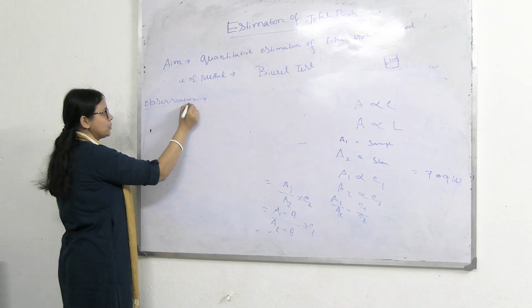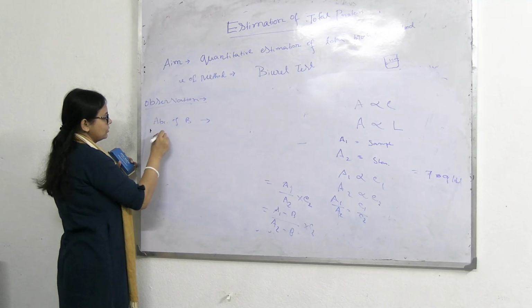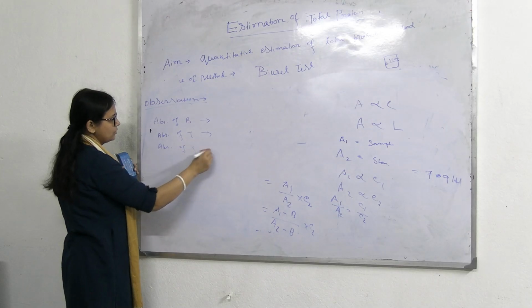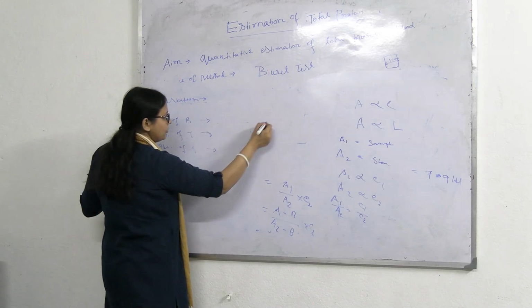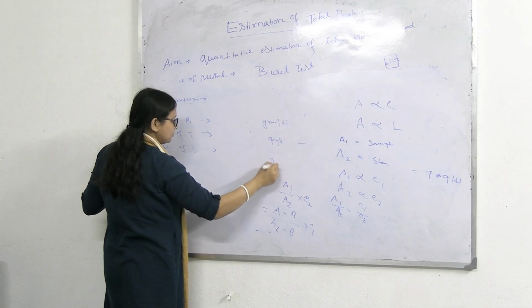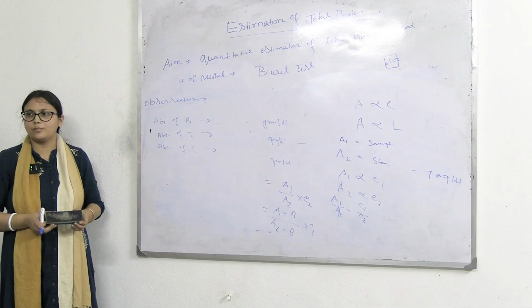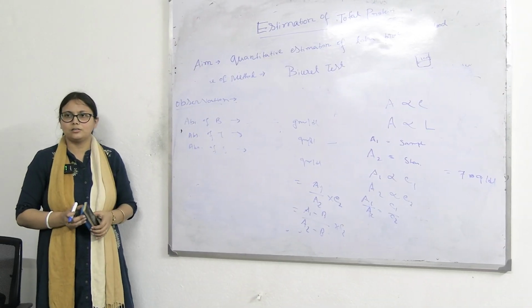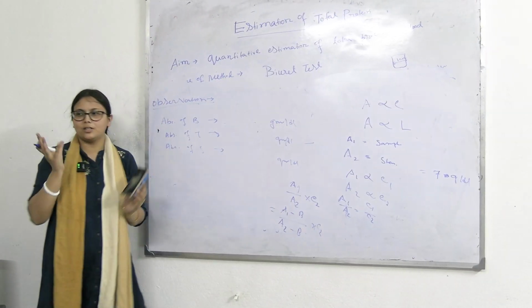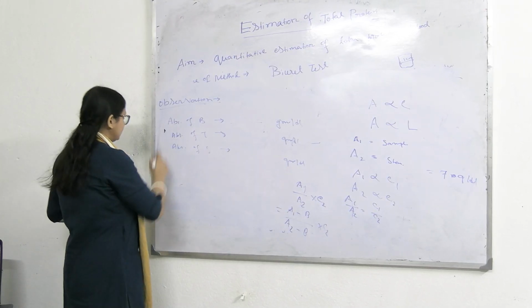অবজারভেশন, নেক্সট পয়েন্ট ইজ অবজারভেশন। অবজারভেশনে কি লিখবি? অ্যাবজর্বেন্স অফ ব্ল্যাঙ্ক, অ্যাবজর্বেন্স অফ টেস্ট, অ্যাবজর্বেন্স অফ স্ট্যান্ডার্ড, যা ভ্যালু পাবি লিখবি। ইউনিট ইজ কি রে, প্রোটিনের ইউনিট কি? গ্রাম পার ডিএল। আর কি প্যারামিটার আছে যার ইউনিট গ্রাম পার ডিএল? ম্যাক্সিমাম ইন মিলিগ্রাম পার ডিএল। Name one parameter which also has unit gram per dl from your physiology. কি রে, কোনটা বেশি পরিমাণে থাকে গ্রাম পার ডিএল এ? বল। Hemoglobin, very good, hemoglobin.